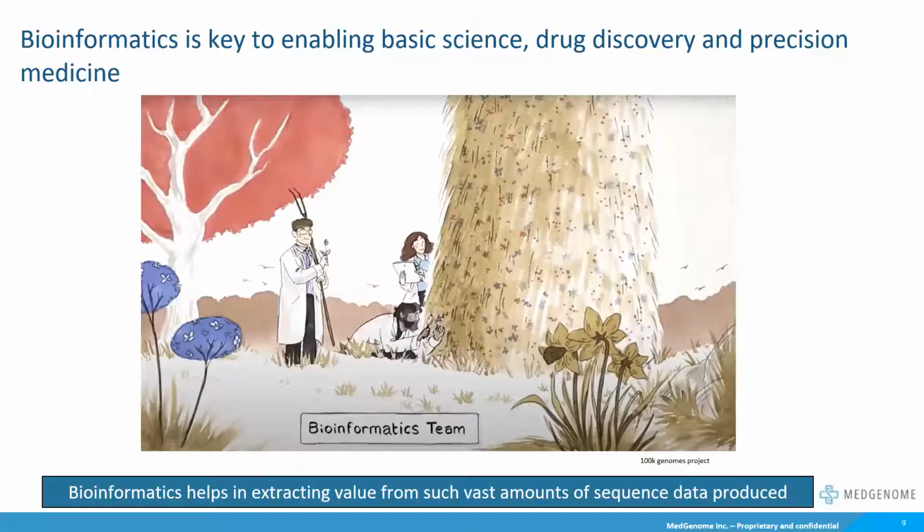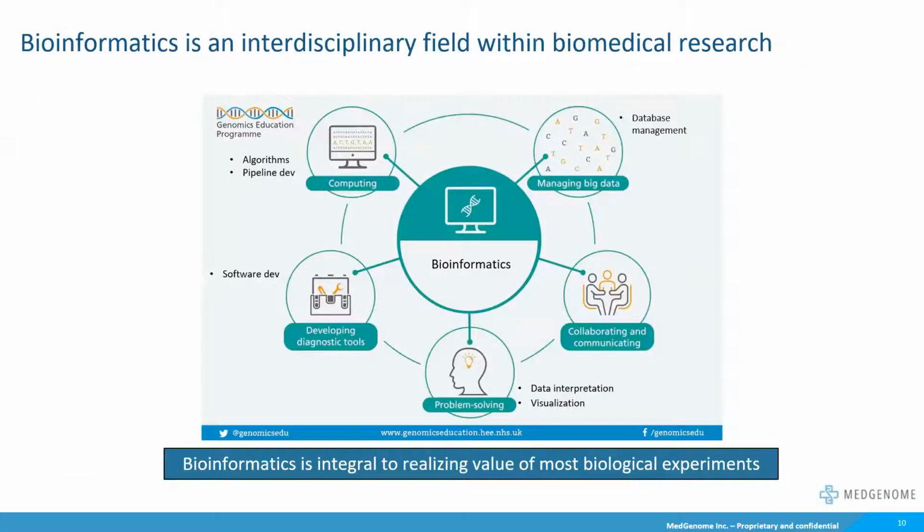And in fact, they help extract value from such vast amounts of sequencing data with a very skilled bioinformatics team. This is an interdisciplinary team that manages large amounts of data, managing the database where such data is housed, looking at algorithms and pipelines that can help with computing complex genomic data coming from a variety of different types, as I just showed you.